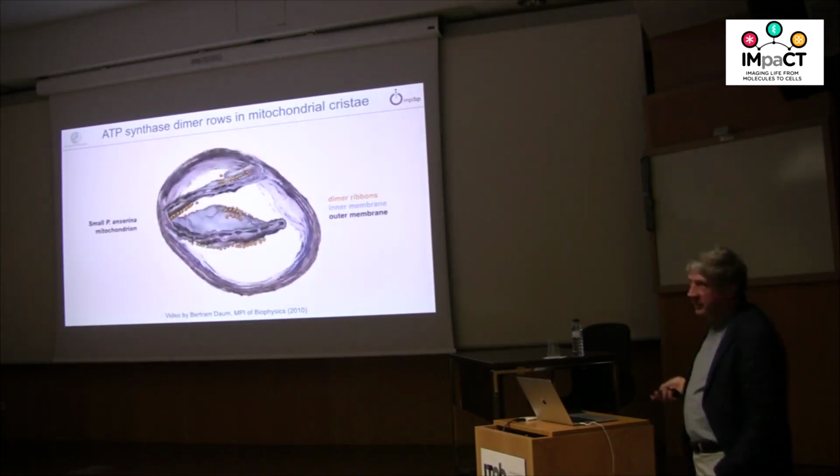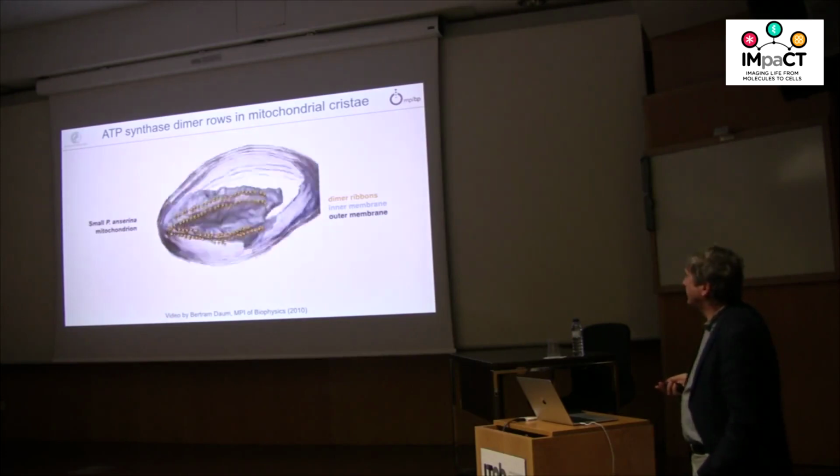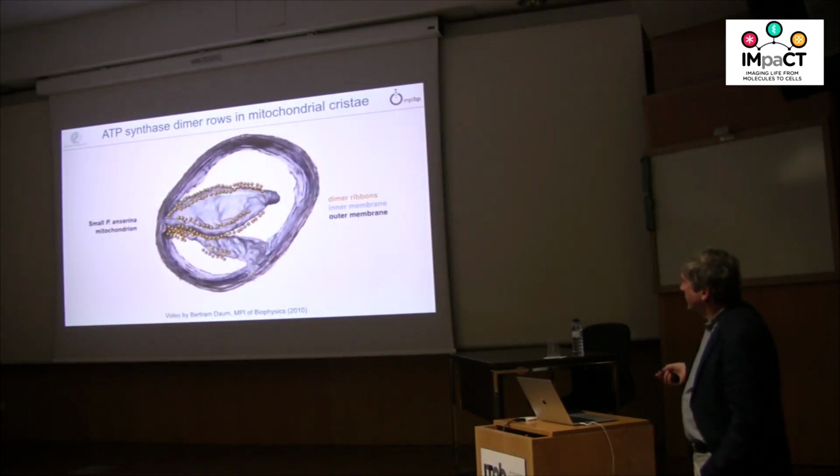And this is a completely general feature of all mitochondria. It's not always the same. Sometimes they're helical, sometimes they are disc-like, but there are always rows of ATP synthase dimers involved.